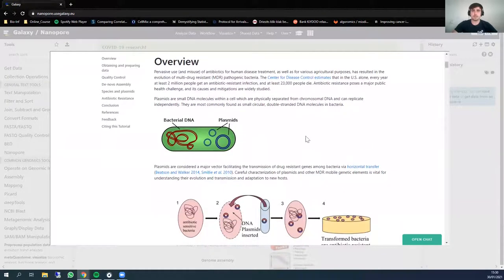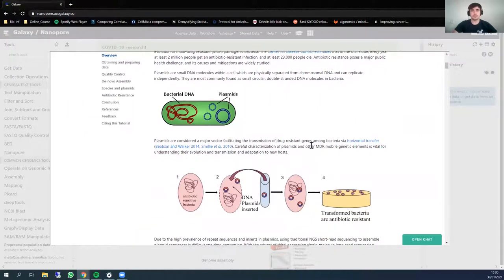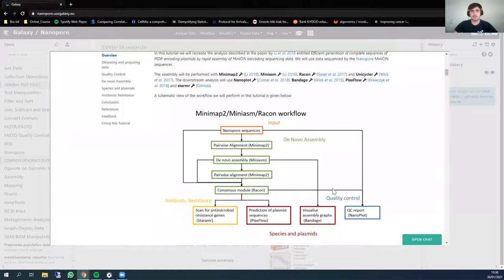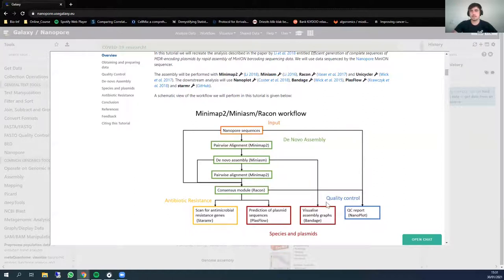Here you can find the introduction — feel free to read it yourself. I just want to point out that we are using data from Li et al., and you can find the publication by clicking the link. In this tutorial we will go through the workflow starting with the nanopore sequencing data. Here you can see all the steps I have just described, including antimicrobial resistance gene detection, plasmid prediction, visualization, and quality control reports.